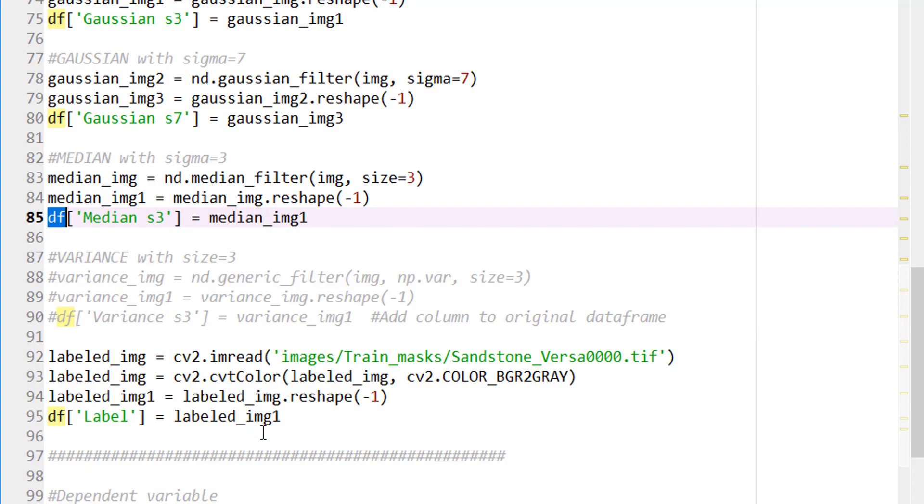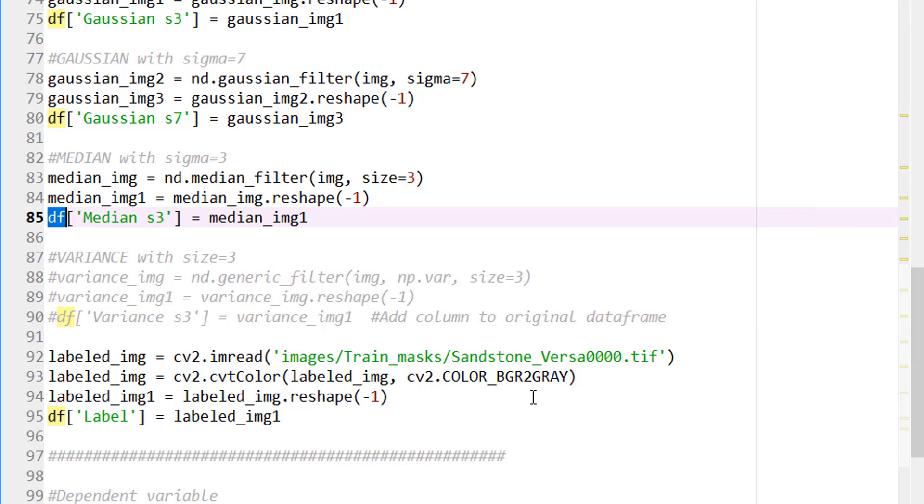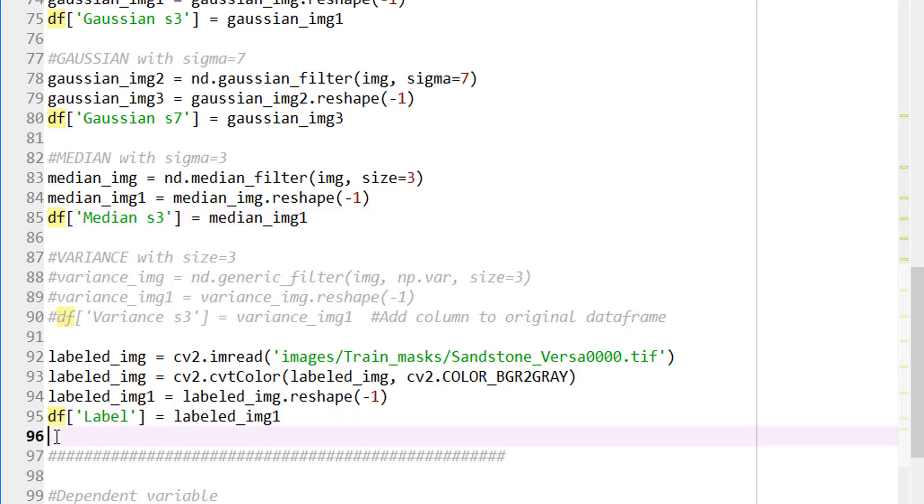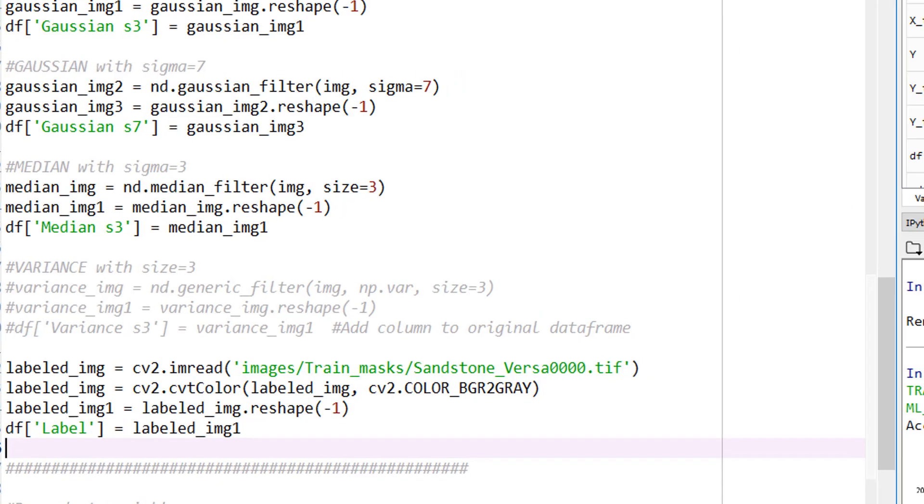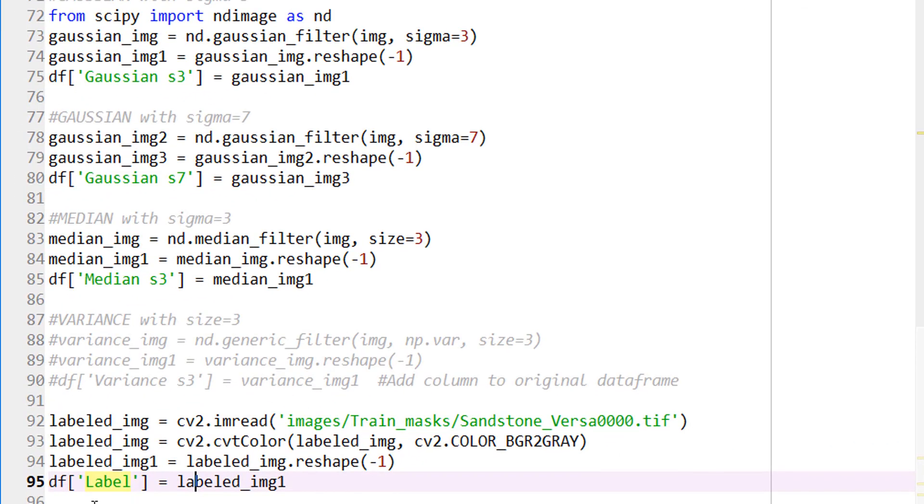For each pixel, we need to label them. That's where we loaded the training mask, which is this colorful image. At every pixel now, we have a label. Is it 0, 1, 2, 3, 4? Those values are added to the data frame. So now, at the end of this, I have a data frame that's ready. A data frame that has 42 columns. The column names are original image, Gabor 1, Gabor 2, 3, 4, and all of these columns, with the last column being labels. Now the data is ready for machine learning algorithm.